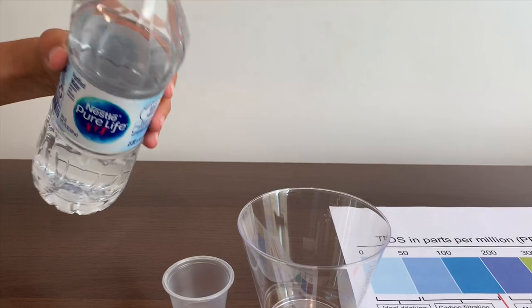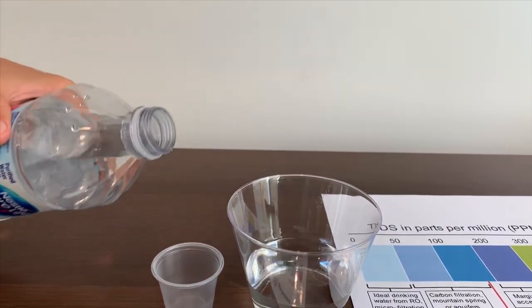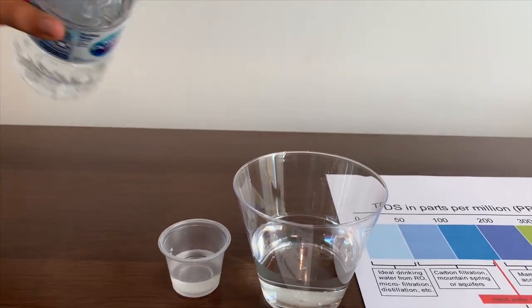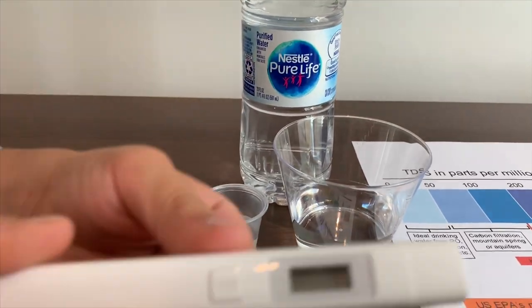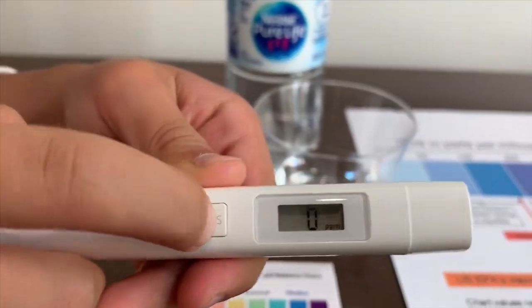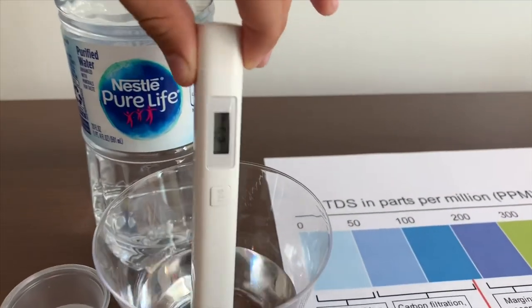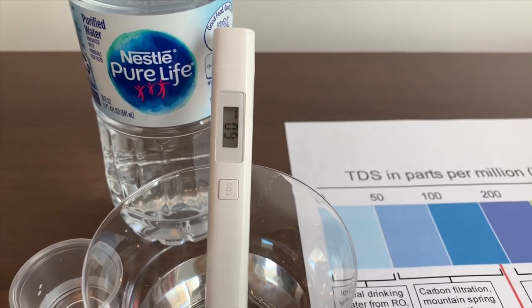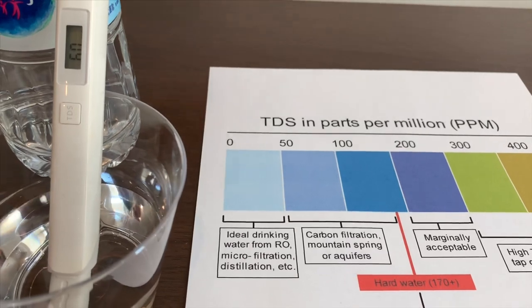First we're going to test the TDS, then we're going to test the pH. Turn on the TDS tester, make sure it says zero, and put it in. It is 60, that means it's okay to drink.